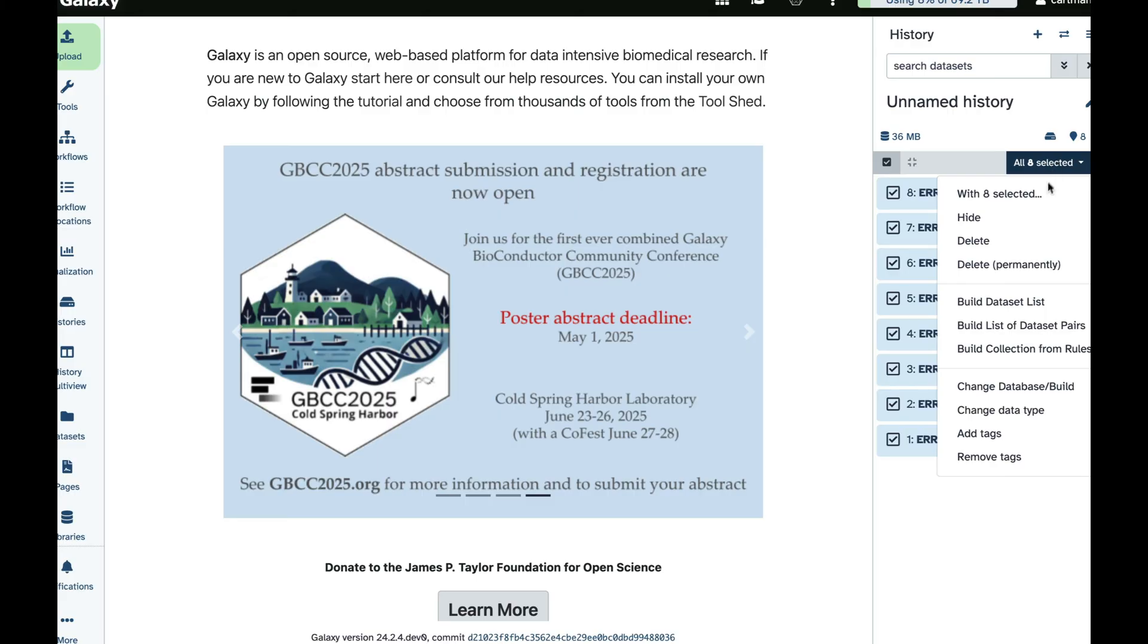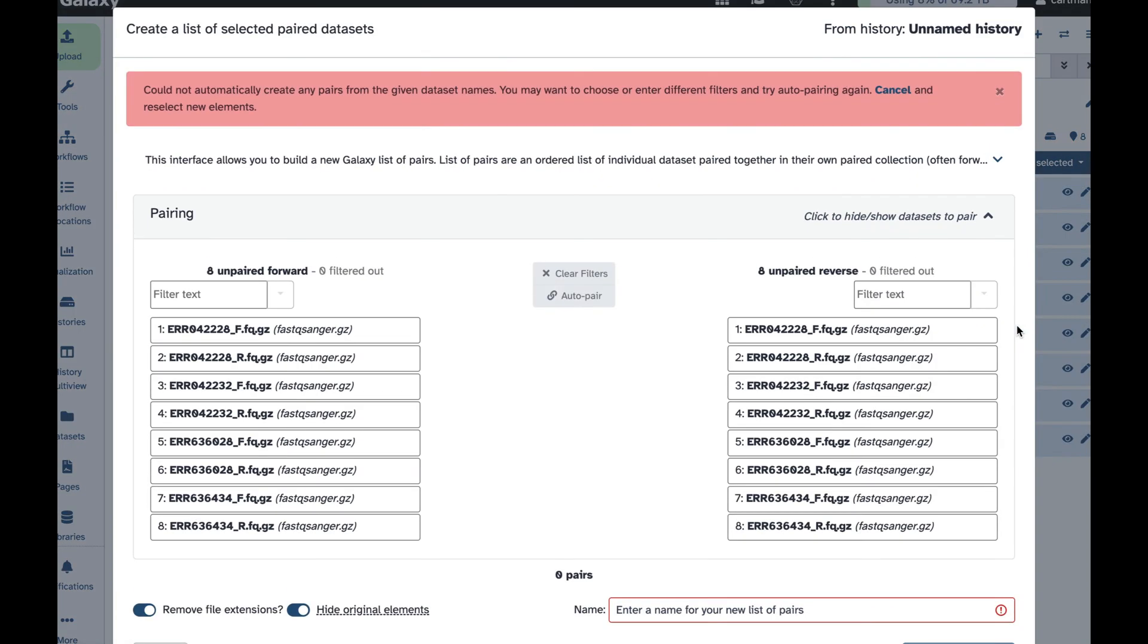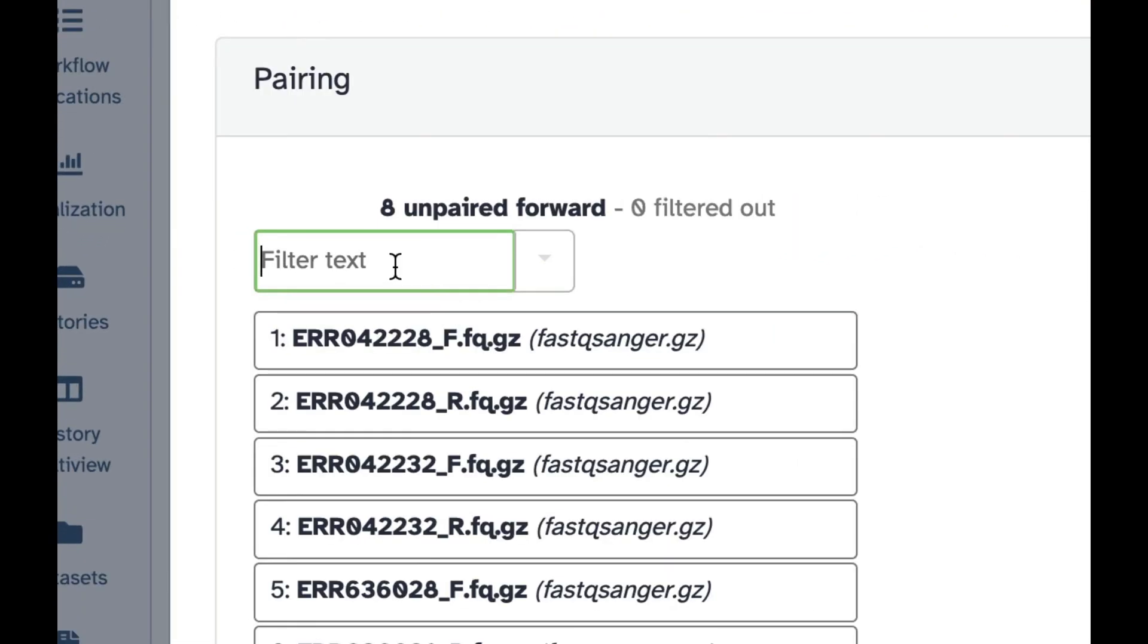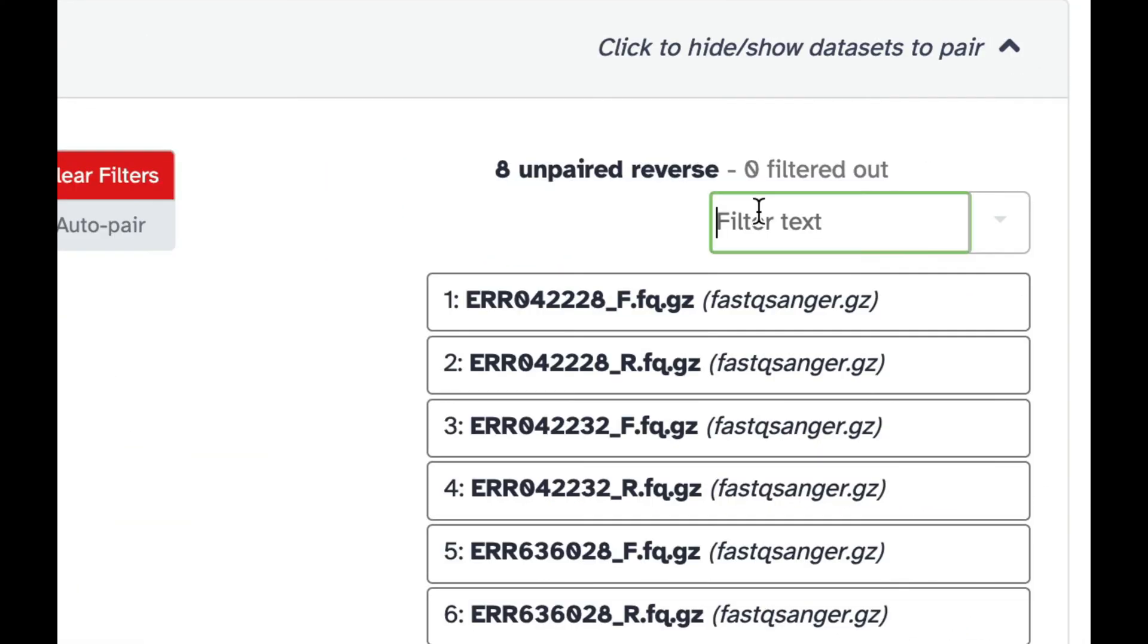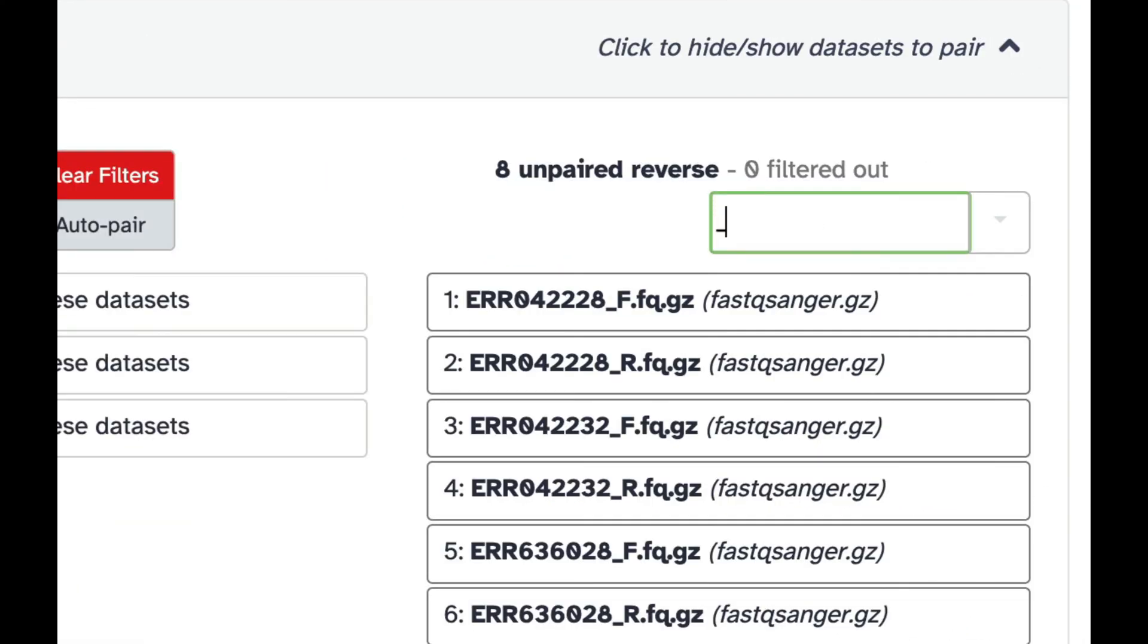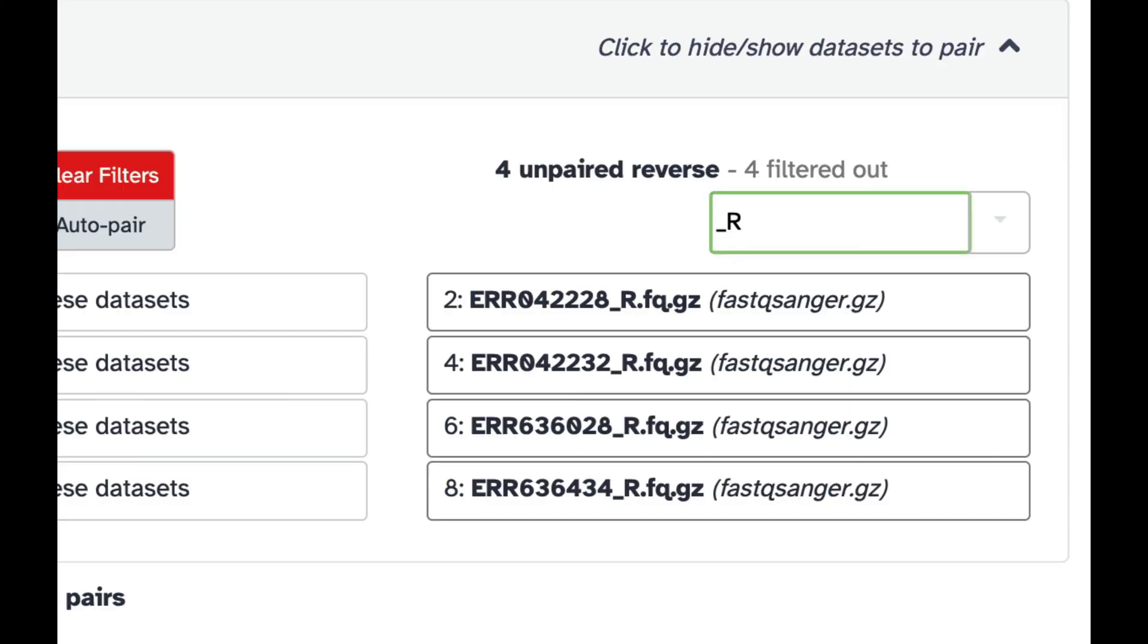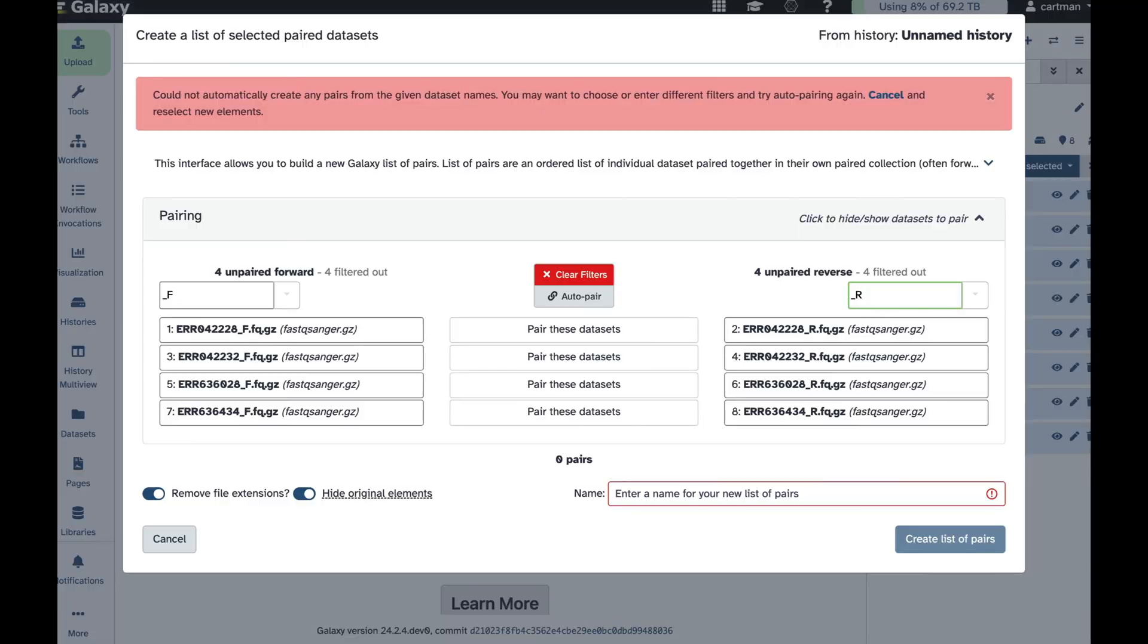And for all eight selected, you build list of data set pairs. This will bring up this interface, and here Galaxy is confused because it doesn't know where the forwards and reverses are. So let's give it a hint. So all forward reads start with underscore F, so here we go. All reverse reads start with underscore R, here we go again.